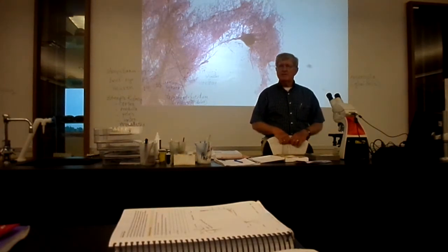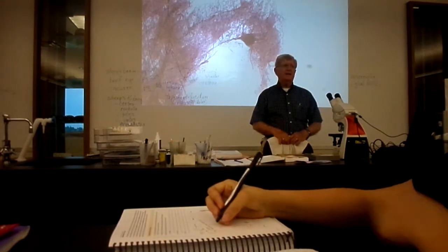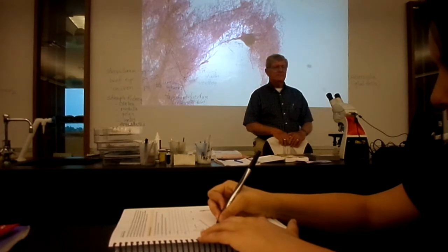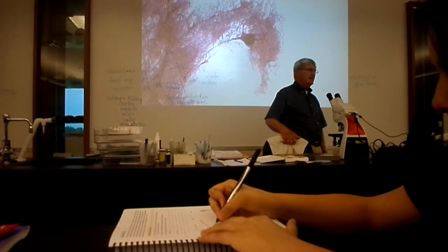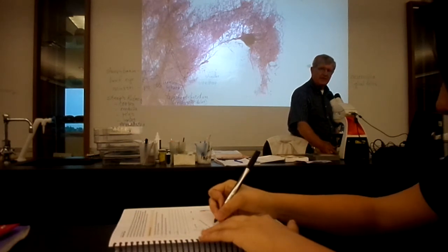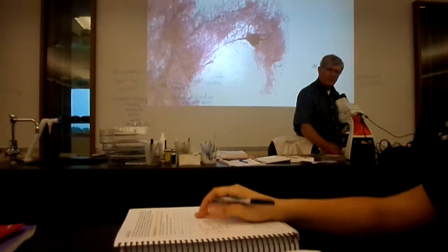Questions about the parts of a neuron? Everyone's confident they can identify them? And if not, I'll be happy to help you. But if you are confident, you can put your slide back in the box, your scope away in the cabinet, and your slide box over on the shelf.